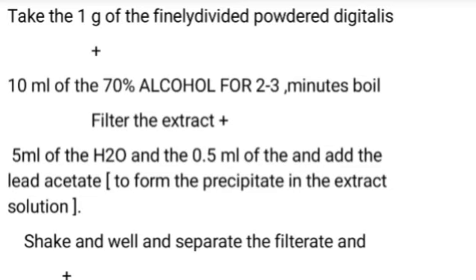To the extract which you got, add 5 ml of water and 0.5 ml of lead acetate.